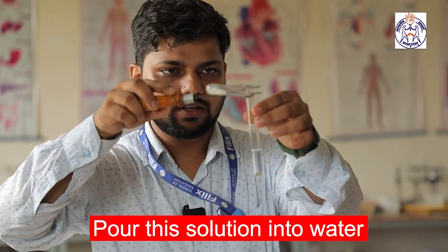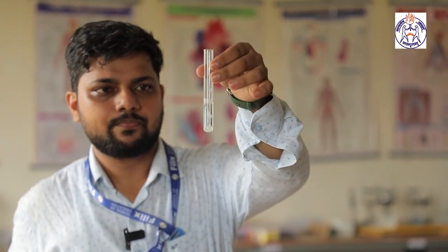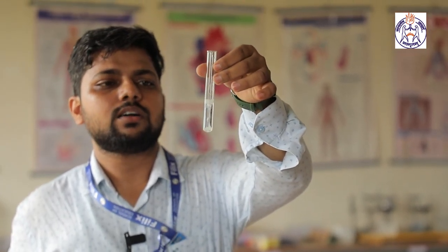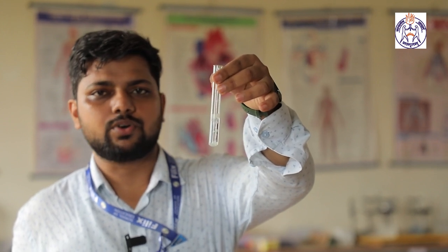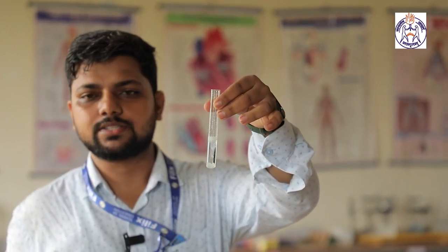But once we pour this liquid into pure water, you will see a coagulation reaction. So this is the presence of protein. By this experiment, we can show whether protein is present or not in any food.